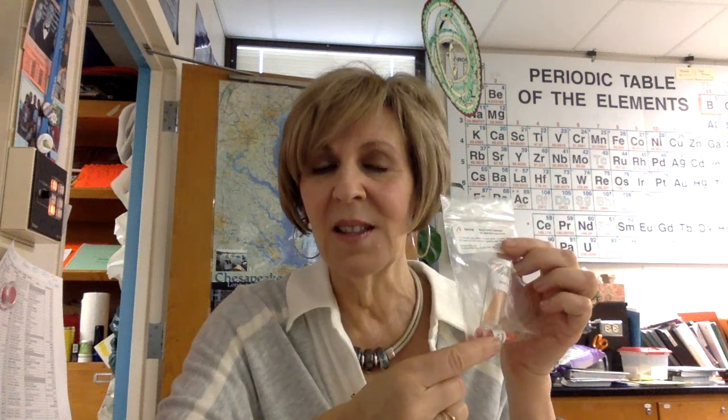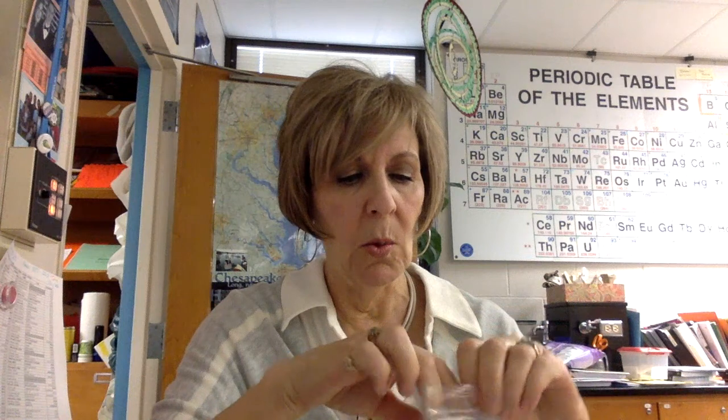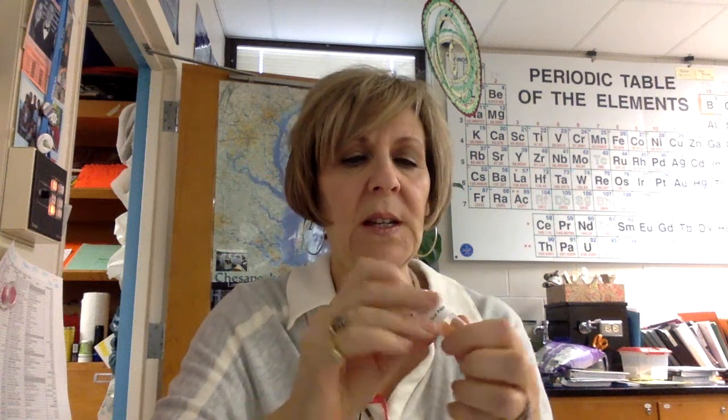Facilitators, make sure that everything in this activity gets read aloud, okay? Because that's important. So the first thing you're going to do in the activity is you're going to test Santiago's blood. And everything is all organized for you. You're just going to take one little tiny test strip.